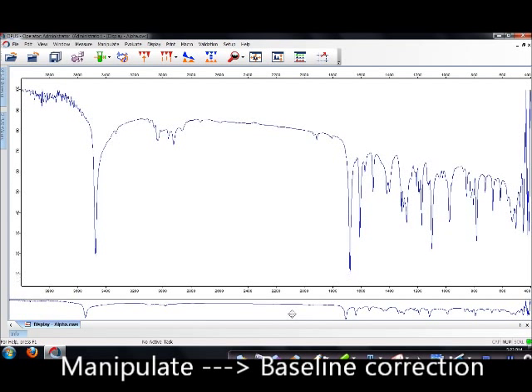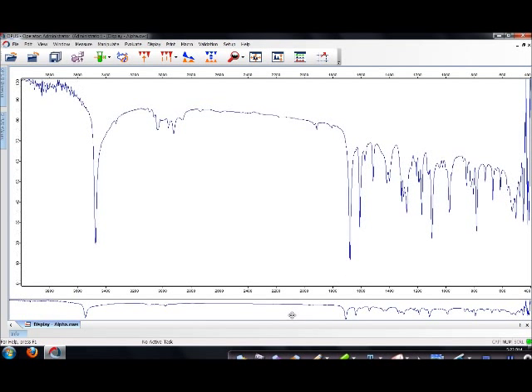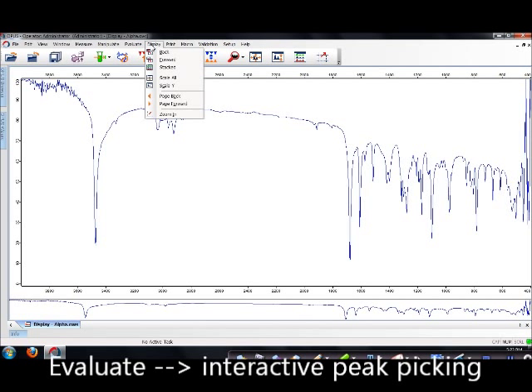At the same time, you'll notice that the peaks that you have picked just now, they're all gone. Don't worry. You can do the same again.